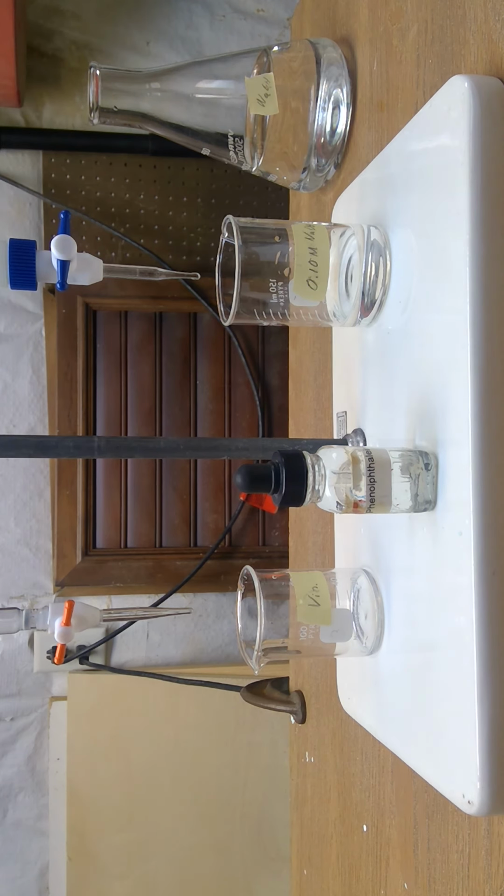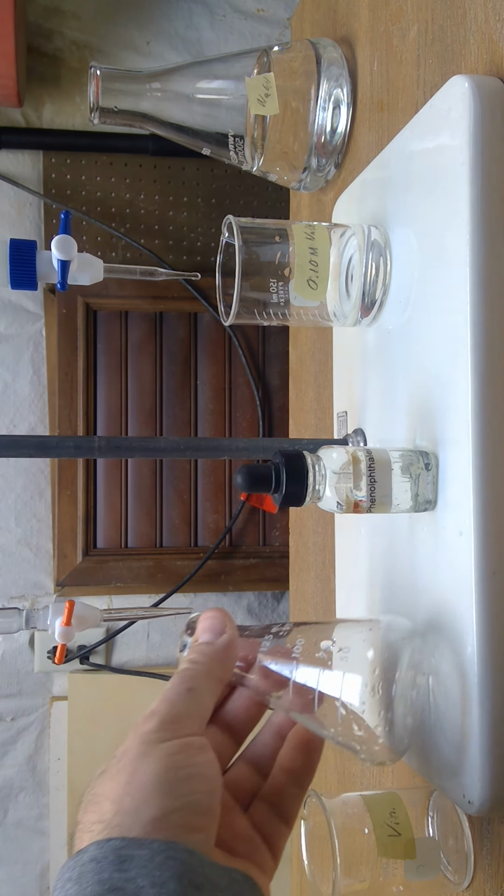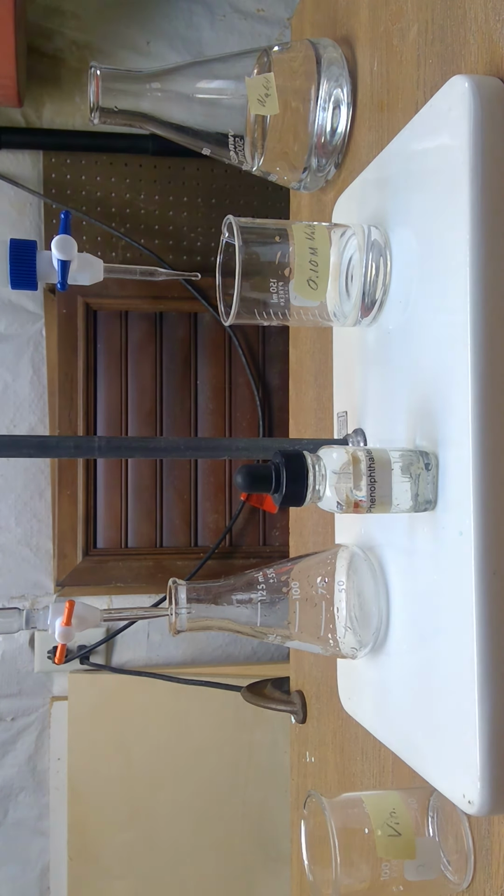So now, in our instructions, we need 2 milliliters of the vinegar. So I'm going to use an Erlenmeyer flask, and this is just rinsed with distilled. Okay, so I need exactly 2 milliliters.